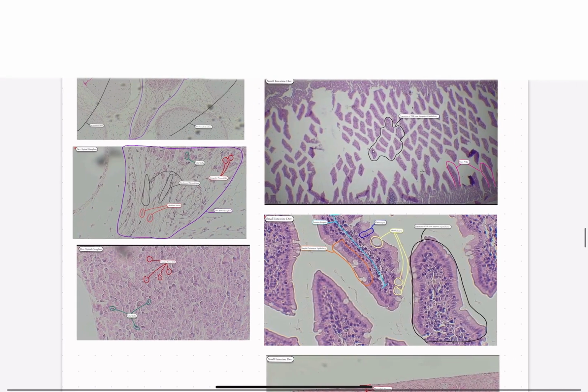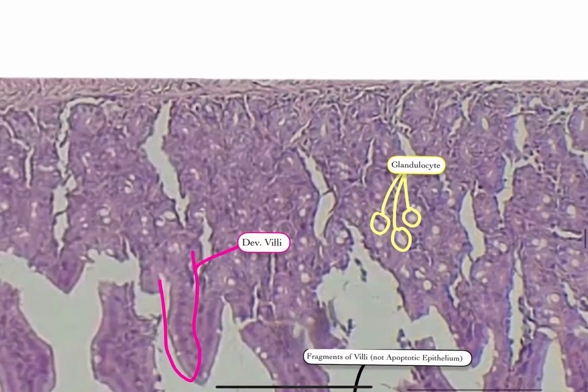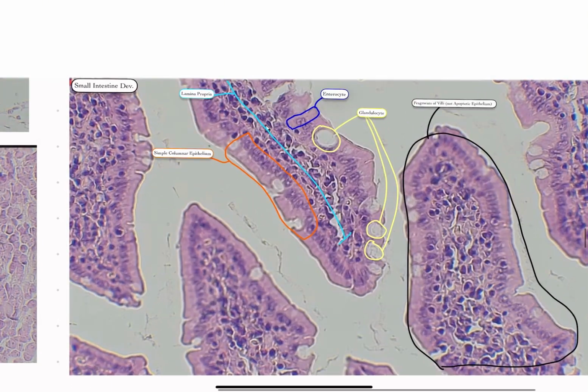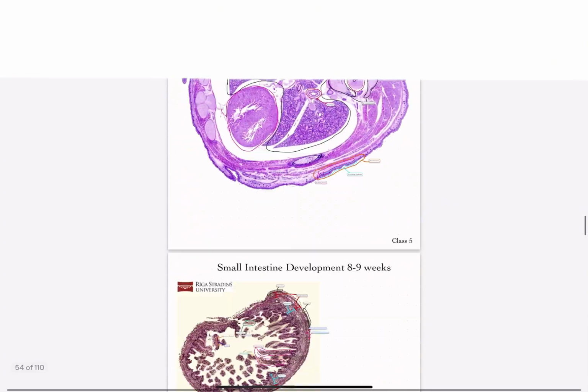All of those would be glandulocytes. If you're feeling unsure about it during the colloquium, you can just ask the professor to show you another example of it. And if you see that it's quite a rare cell, like it only appears in a few per villi, then you'll pretty much know for sure that it's a glandulocyte you're looking at and not an enterocyte.